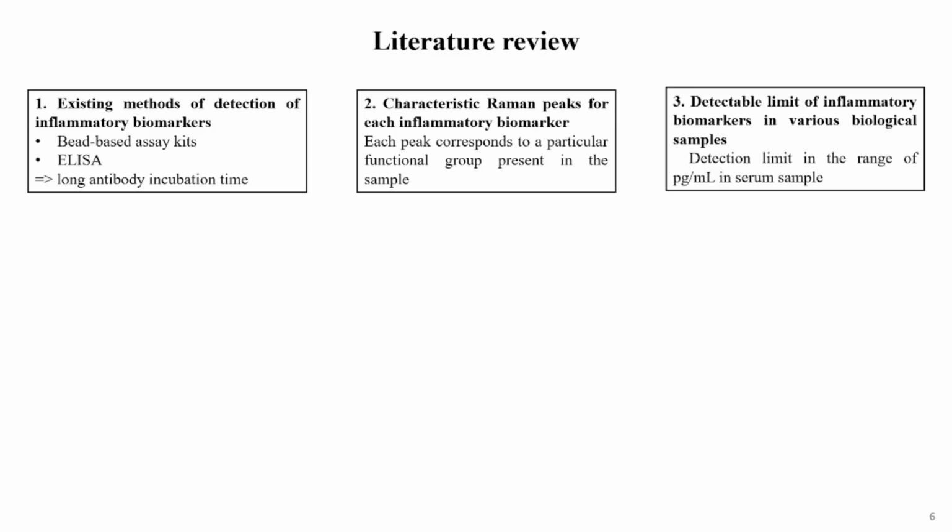The second part is to understand the characteristic Raman peaks from the literature and to correspond every bond present in that molecule to a particular peak in the Raman signal. And the third one was to do a study based on the maximum detectable limit of an inflammatory biomarker in different samples, be it serum sample, urine sample, or saliva.